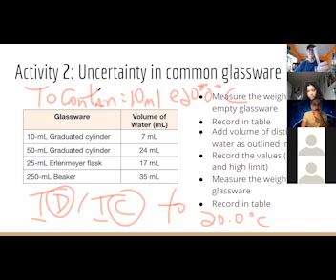What's the other thing we will use this for? So it'll hold 10 mils of water. What else can we do with the water after we've put it in here? Measure. That's the contain part. We've measured 10 mils. Now, after we've measured it, what do we do with it generally? Deliver. Bingo. Man, you guys are sharp today. Yes, deliver. So it's one of the few things that is designed to both hold a particular volume, and then once you've measured it and pour it out, it will deliver that same volume.